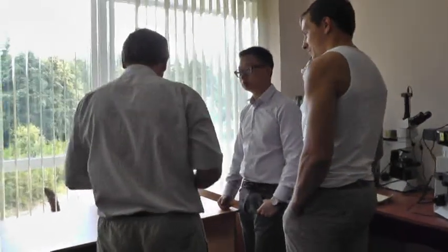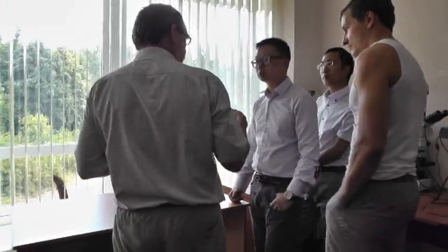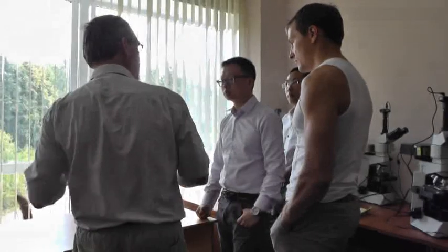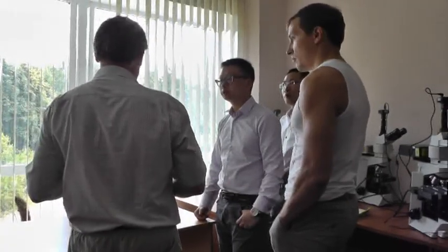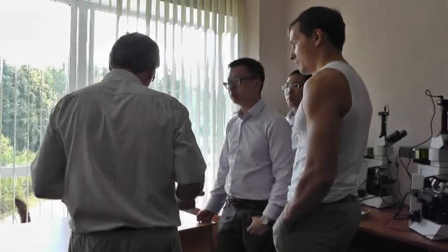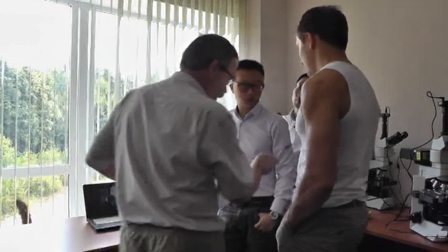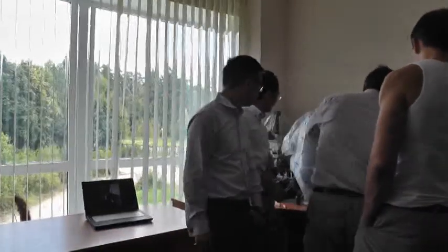And besides, we need to focus our laser beam, so we should avoid any additional optics. That's why we either use this kind of microscope, or I can show you also.